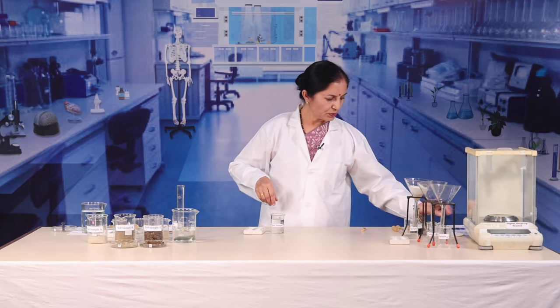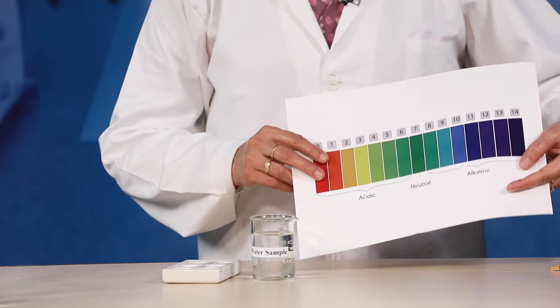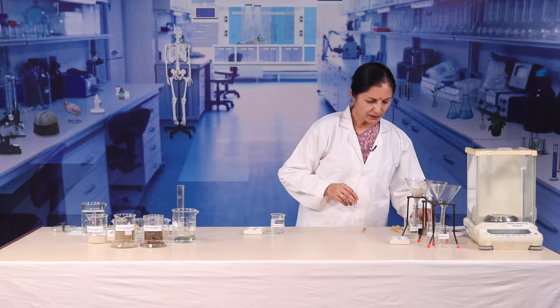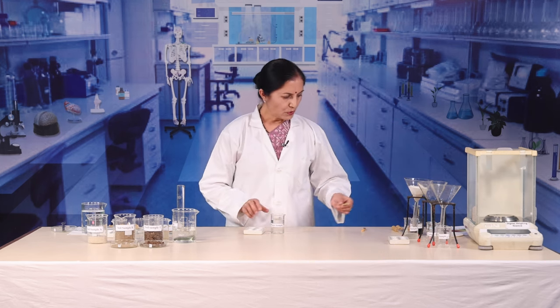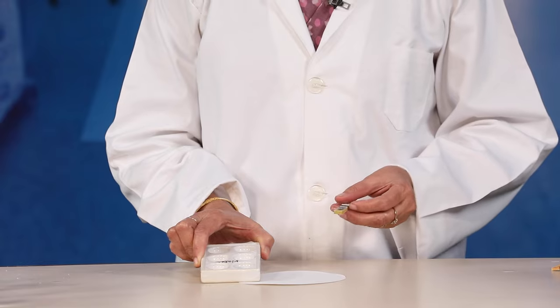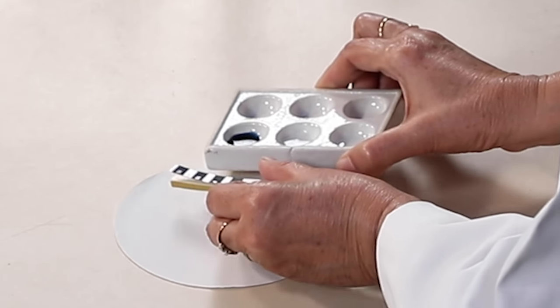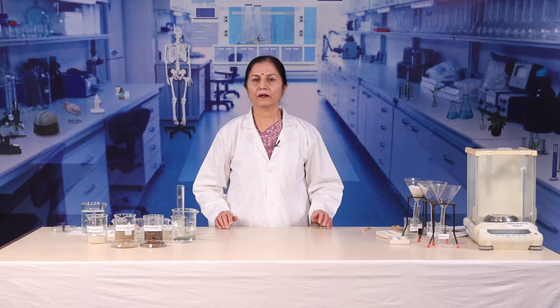And note the pH using the pH chart paper or the color indicated on the pH paper strips. We can see that the color which has been developed in this cavity matches with pH 9. So this water sample is also alkaline. Now we will record our observation in the table.